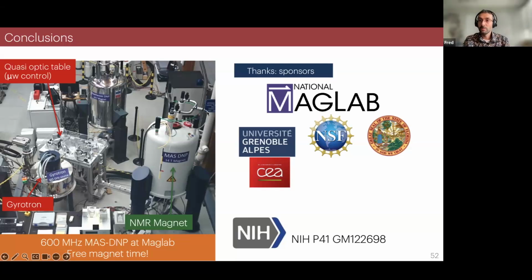Yes. But having now done these experiments, and they are painful, I would just recommend to compare the signal to noise you obtain for the optimal recycling delay in between biradicals if you really want to be sure of which one is the best. So you make identical samples, you just replace your radical, and you can compare the signal to noise ratio for each of the experiments.